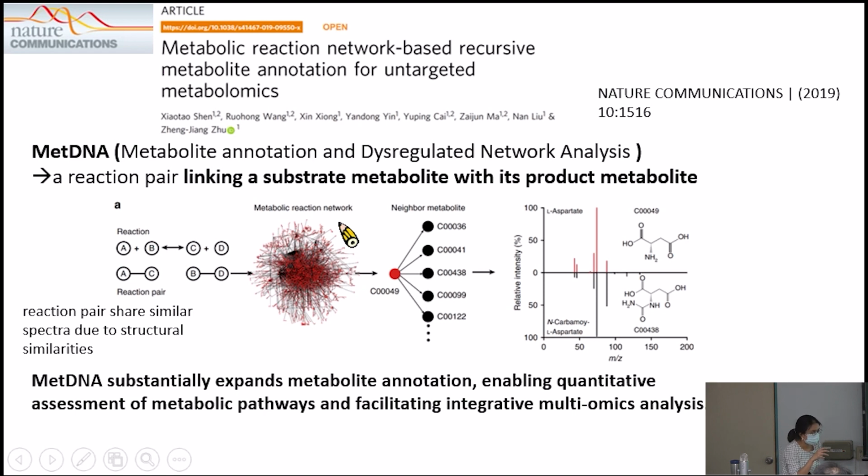Within one cell, there are multiple pieces of information that can be detected, based on their different mass to charge ratios. So you will get multiple peaks there.